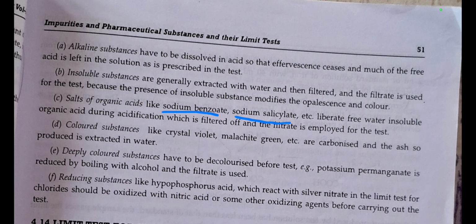First we treat with the acid, so it liberates the water-insoluble organic acid. Later we can perform the limit test for chloride and sulphate.